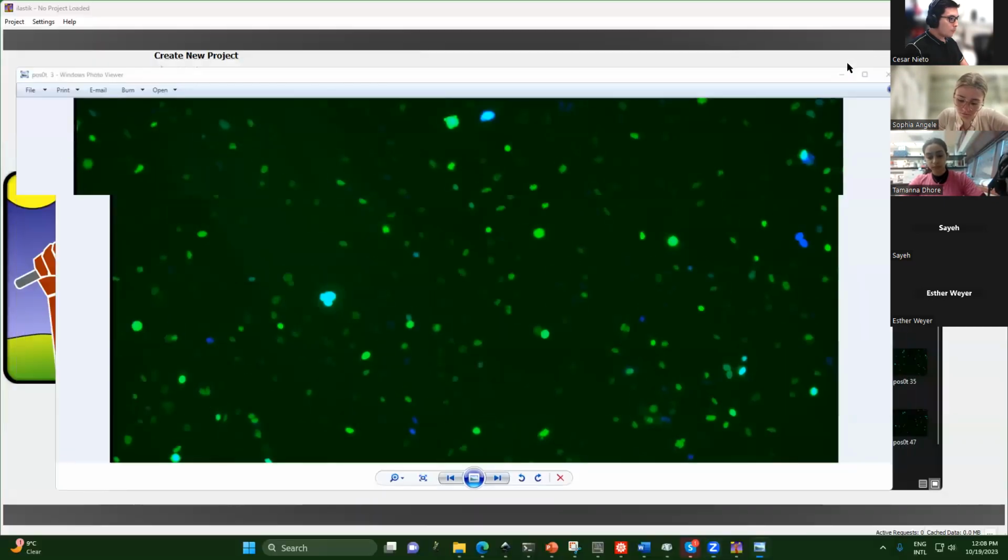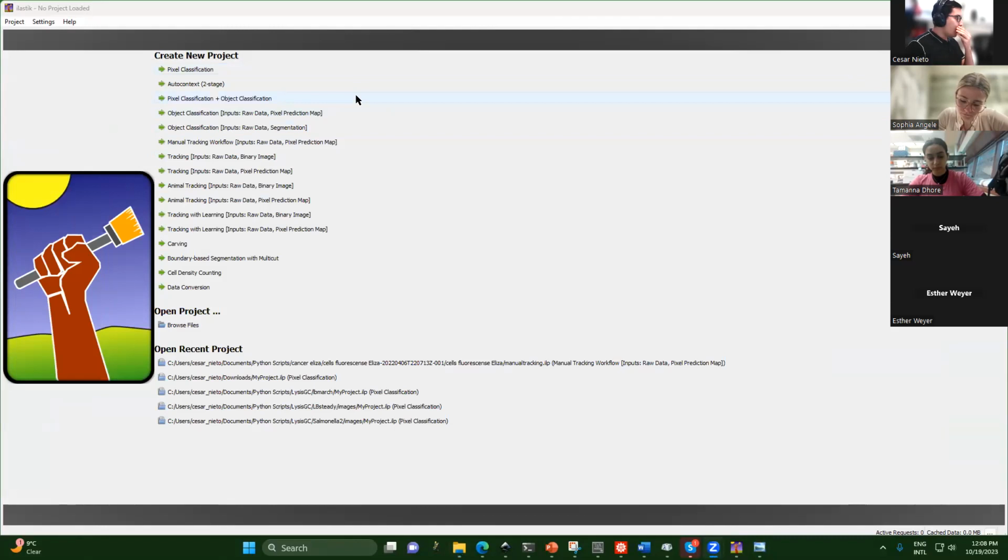Okay, so for Ilastik, we're going to need essentially 2 tasks. The first one is pixel classification, which tells you if you have cell or background. It's going to give you something called a mask that you can also decodify in .tiff files. So you can assign a number to any pixel of your image, let's say 0 to the background and 1 to the cell.